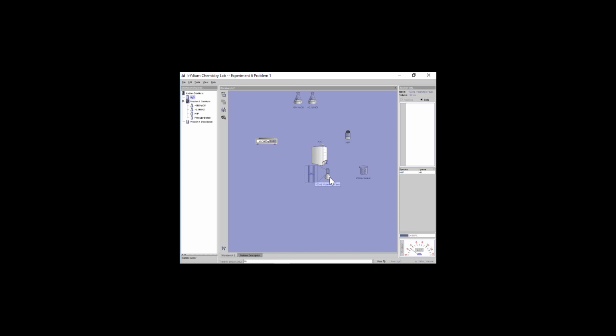As I'm getting close to the mark here, maybe I only want to add 1 ml at a time. Again, you probably wouldn't do this with a big jug of water, but as you see me pressing enter and pressing pour, this one here is steadily climbing upwards. I'm getting pretty close to the mark. And as I get right up close to the mark, it's actually best to take out one of those dropper pipettes and drop it in really, really finely until the bottom of the meniscus is exactly 100. I might overshoot it here.